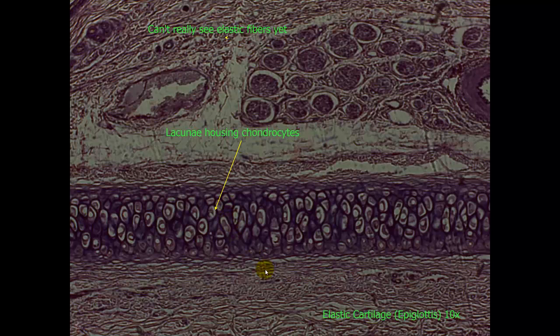Now here is elastic cartilage. This is from the epiglottis. This is a 10x objective. This is the lacunae housing the chondrocytes. This is the elastic cartilage. You can clearly see the lacunae. However, you can't really see the elastic fibers yet. As you get a closer magnification, those will become more apparent.